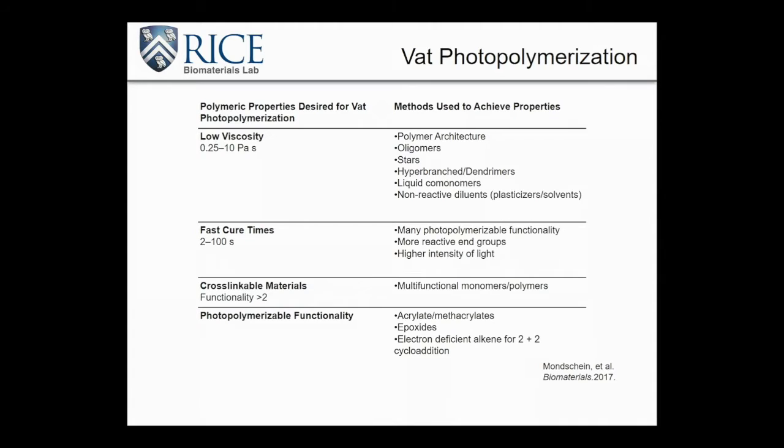The crazy thing about photopolymerization, like I said, is you can drastically affect how much cross-linking is taking place in those scaffolds by adjusting the exposure of each layer. And you can get anywhere from 2 to 100 seconds that you see in these methodologies, which will, again, not only alter the mechanical strength of your materials, but it will affect cell viability, and it will affect, of course, printing time.